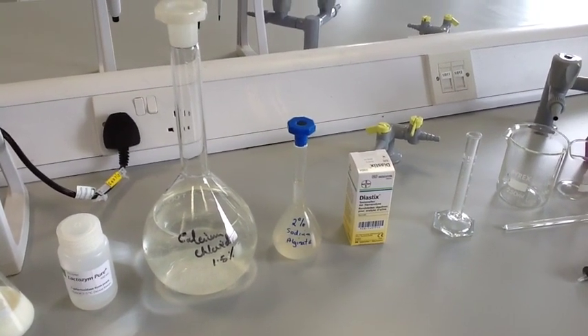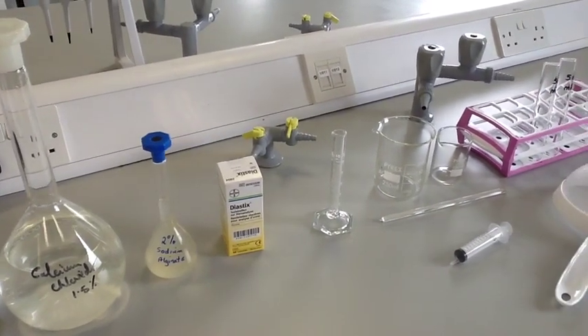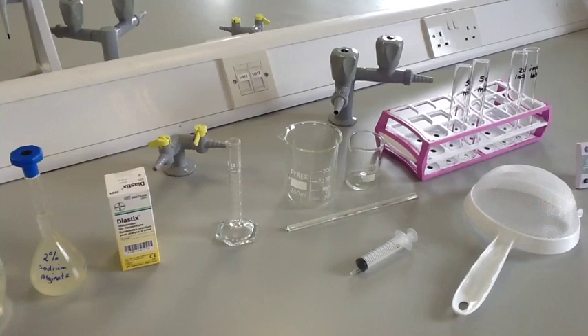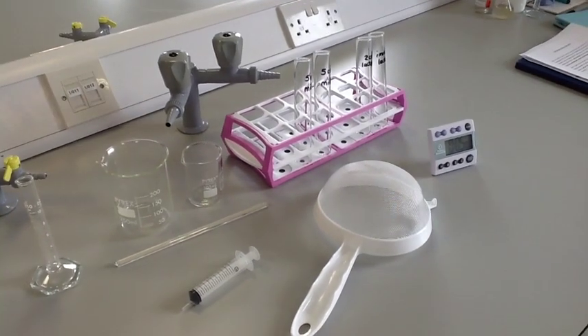You will also need a 10ml measuring cylinder, a 100ml and a 250ml beaker, a glass stirring rod, a 10ml plastic syringe, a tea strainer or sieve, 4 boiling tubes, water baths set at 30, 40, 50 and 60 degrees centigrade, and a stopwatch.